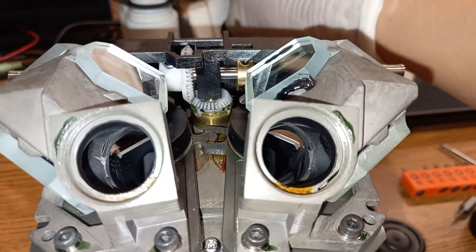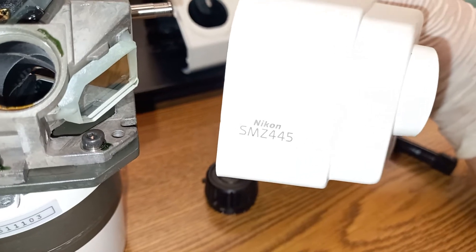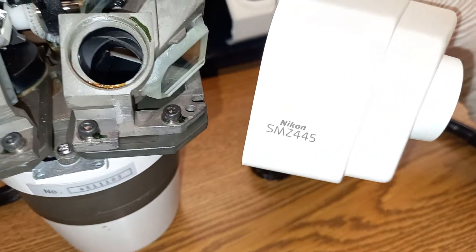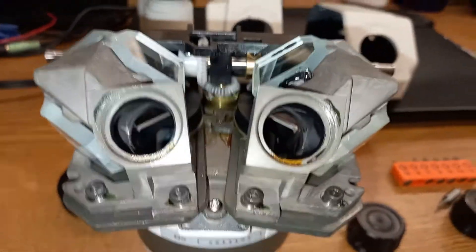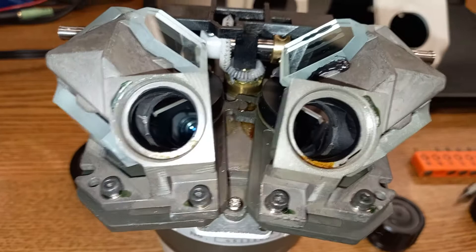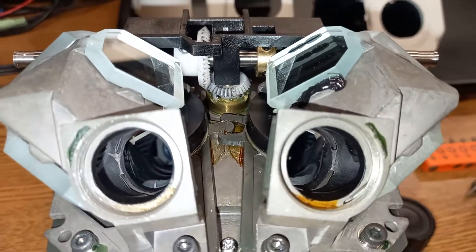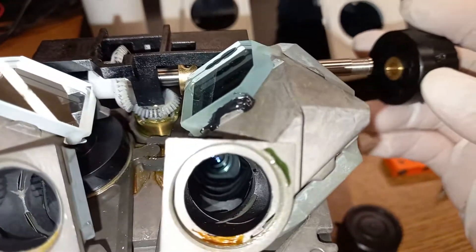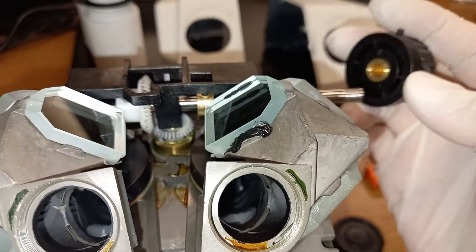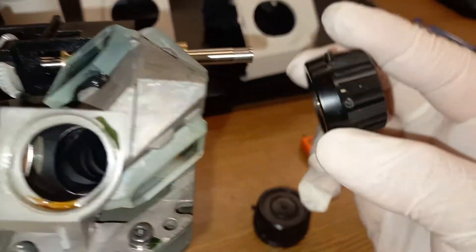Greetings ladies and gentlemen, it's me Henri. I have here a Nikon SMZ445 microscope. The purpose of this video is to demonstrate what this microscope looks like inside, and also to highlight some key components — that is a pun — of this microscope in order to take it apart, or disassemble it.